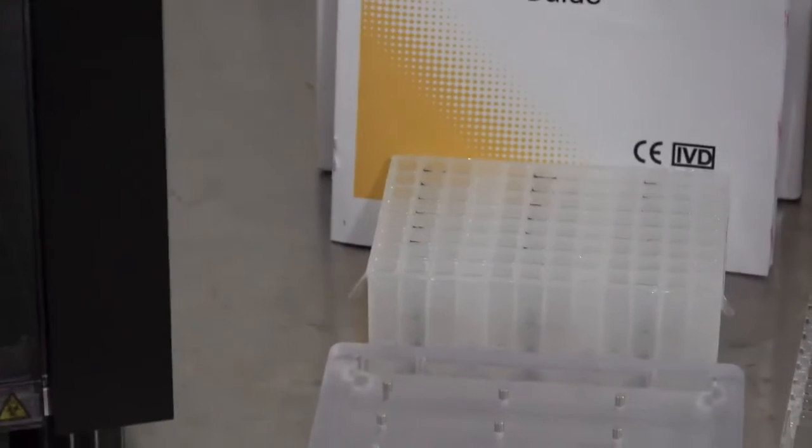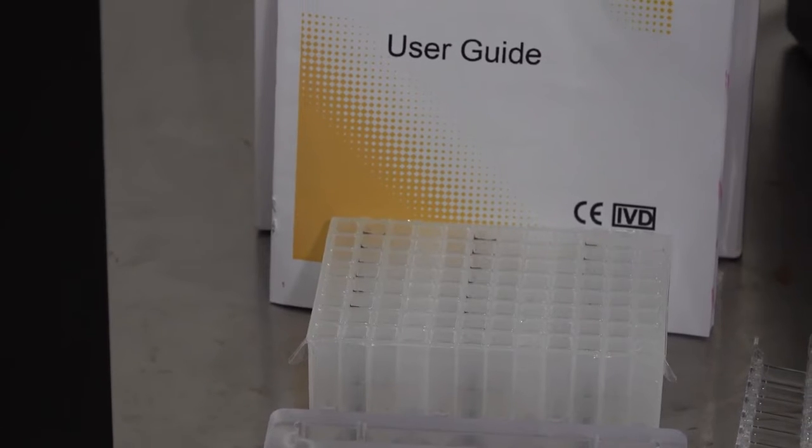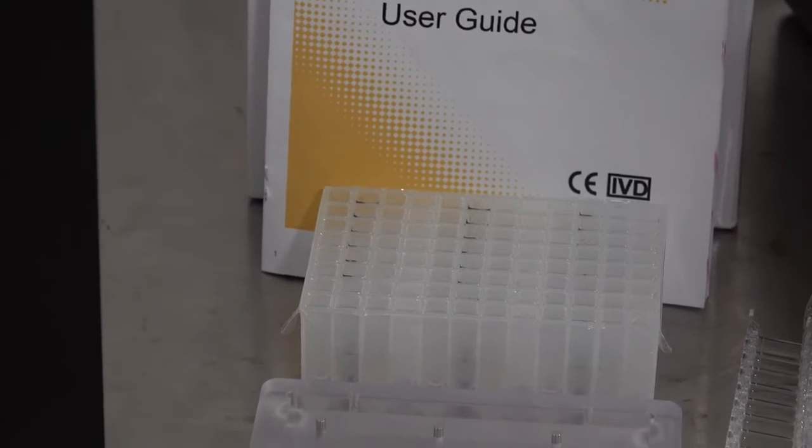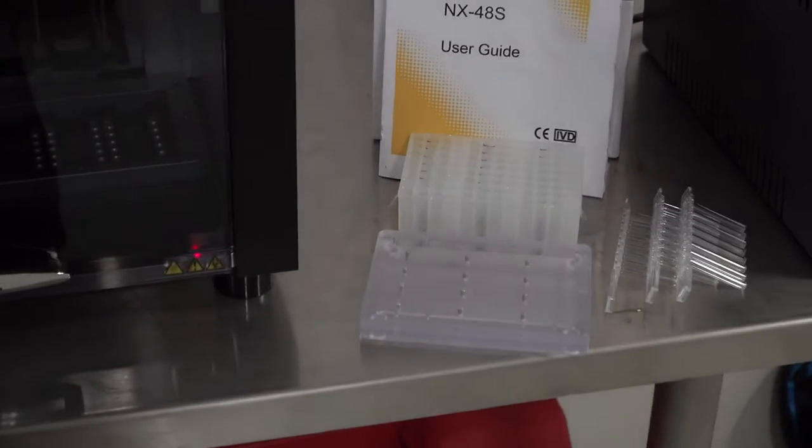The cartridge basically consists of 3 wells multiplied by 8 so we have 24 wells in which you can extract the sample and you can install two of these cartridges in the unit at any given time.